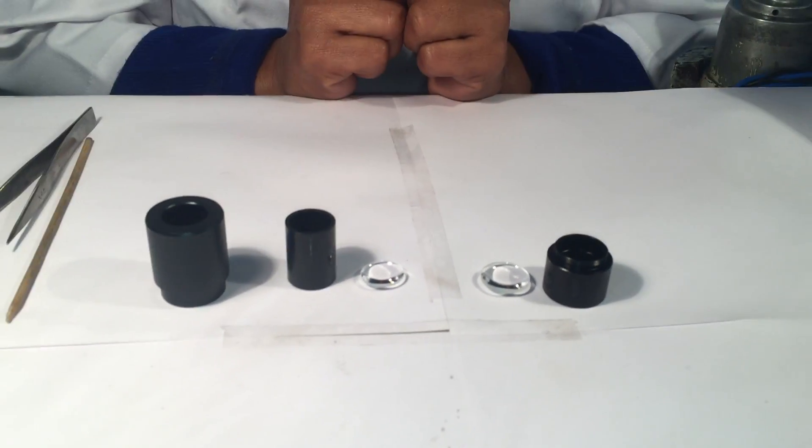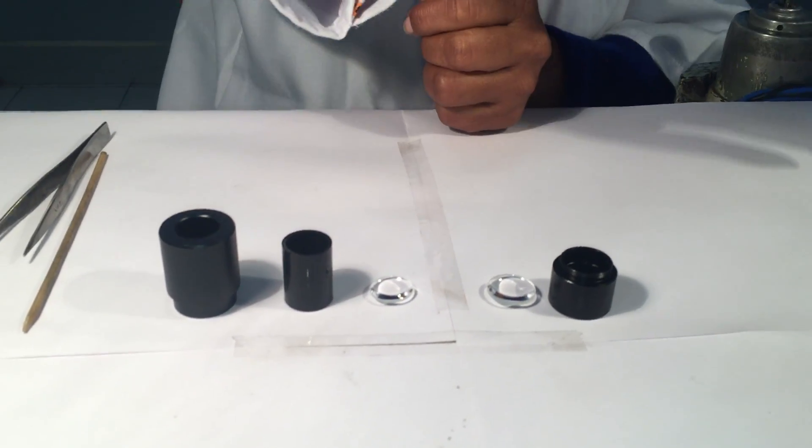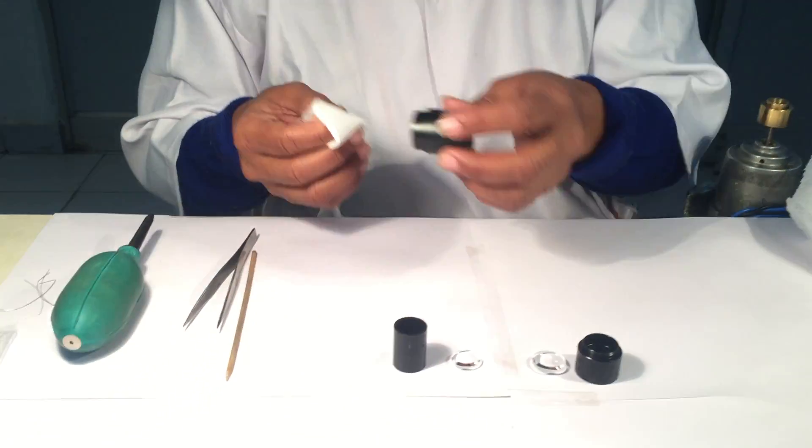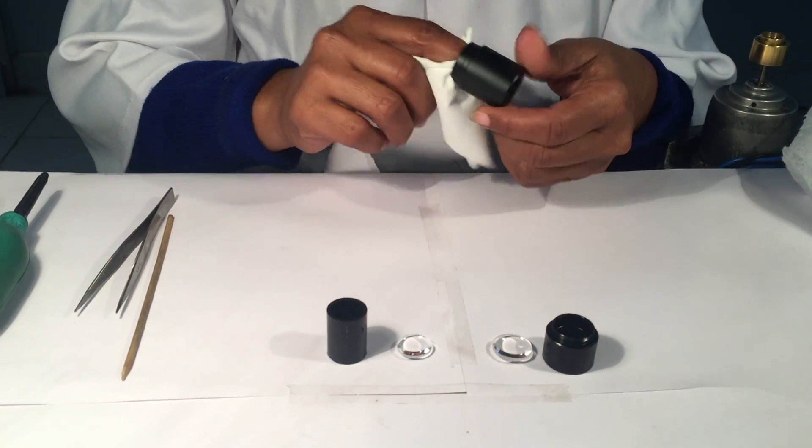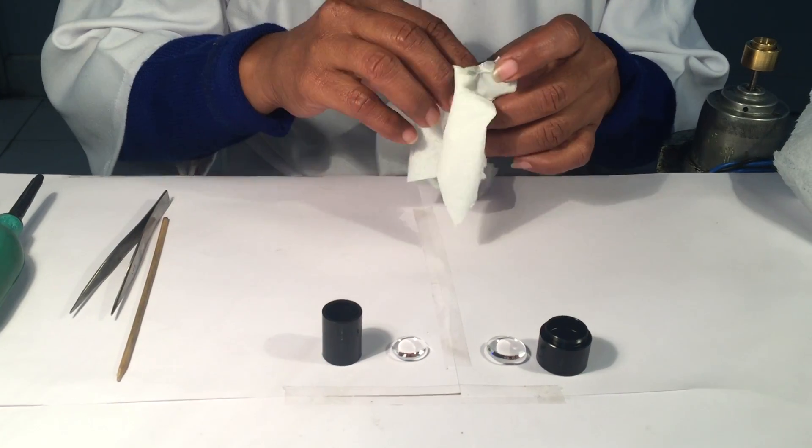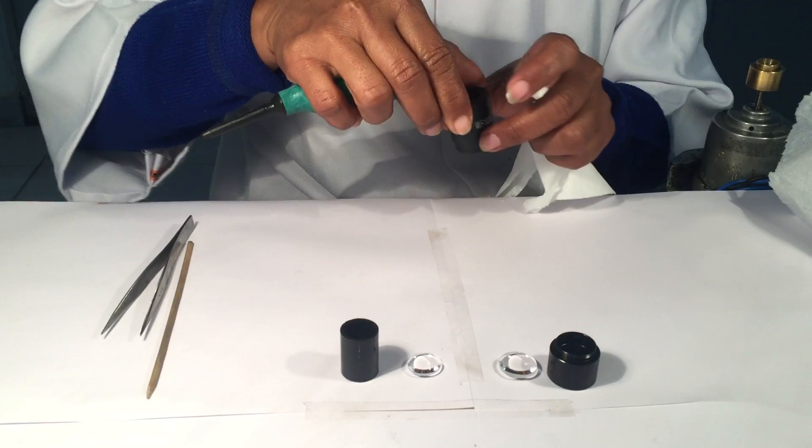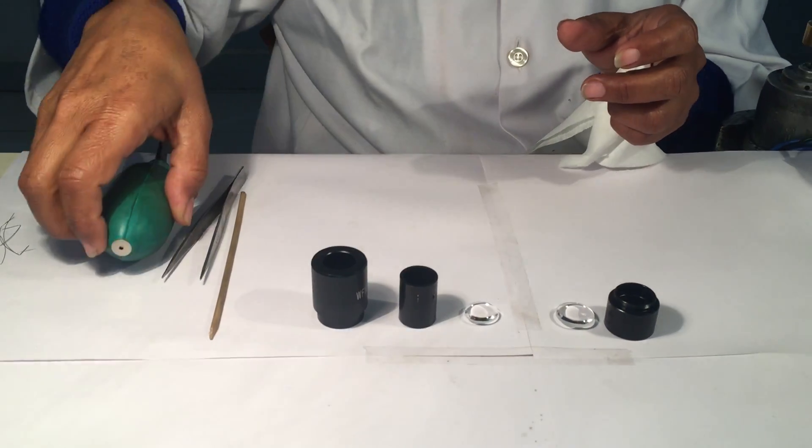So now we will do the cleaning process. We will take a plain cotton tissue paper and rub it firmly inside the upper part. Then we will air blow the same, just in case any particle is left.